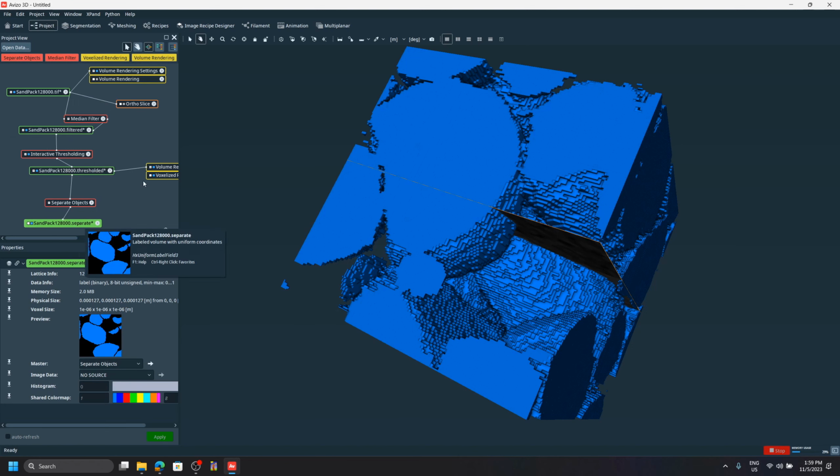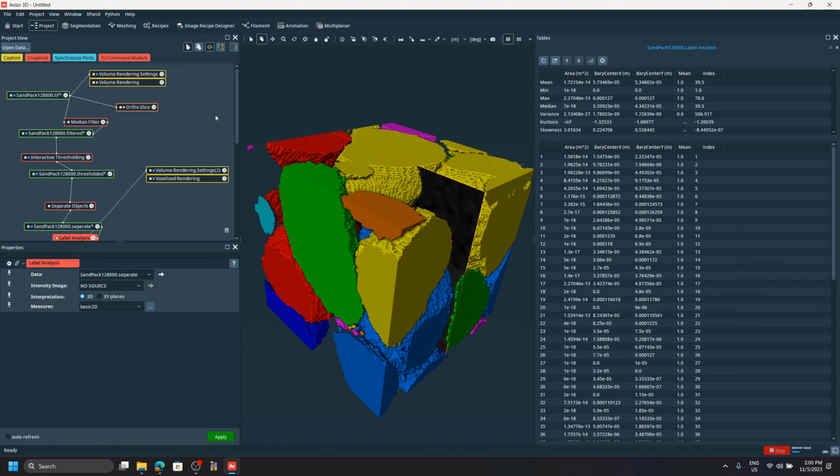And an important thing to point out is that we did all of this in the project window, right, over here, just manipulating stuff here. So I mentioned that because in the next example, we're going to use the segmentation workroom, okay? And that's where the AI segmentation tools will be, okay? It's not going to be here, all right? But this was more to give some people who are not familiar with Avizo just a general feeling of how Avizo works, okay?